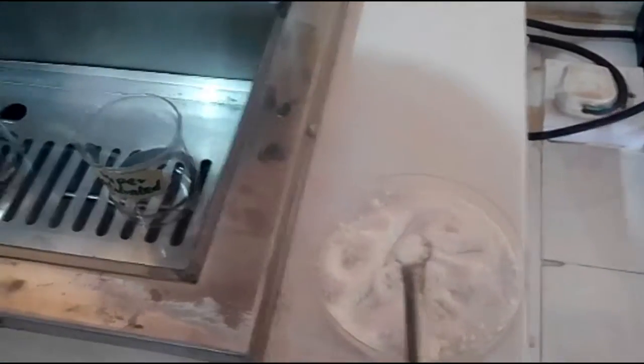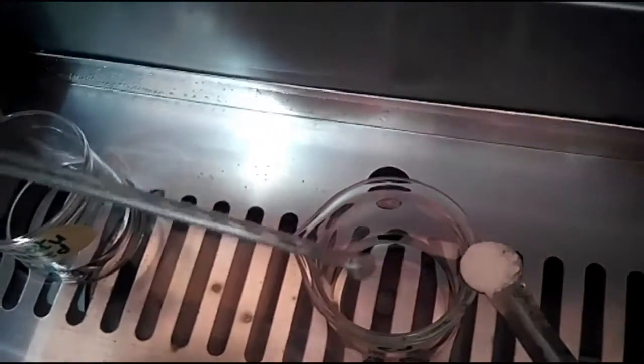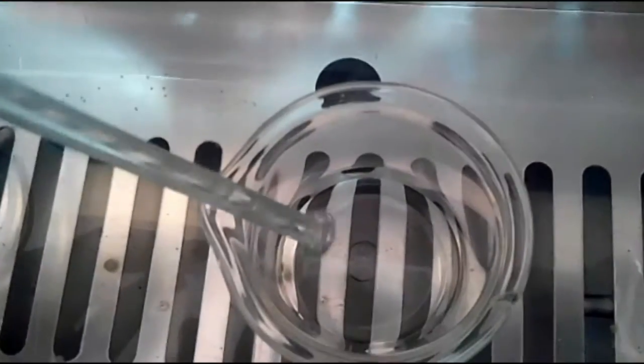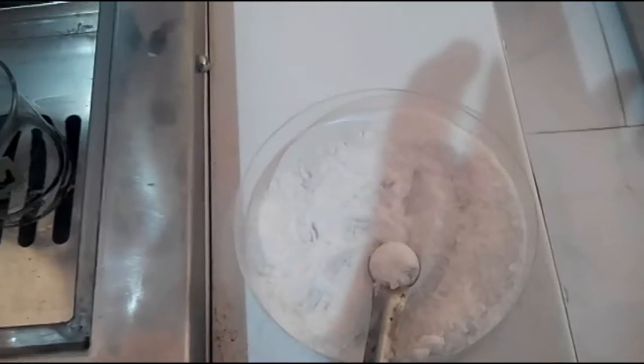Begin to fetch the salt little by little into the beaker labeled B. Stir and continue to stir until the water just no longer dissolves the salt. Here, the salt completely dissolved. That means it is unsaturated. You then add more salt and continue to stir again.